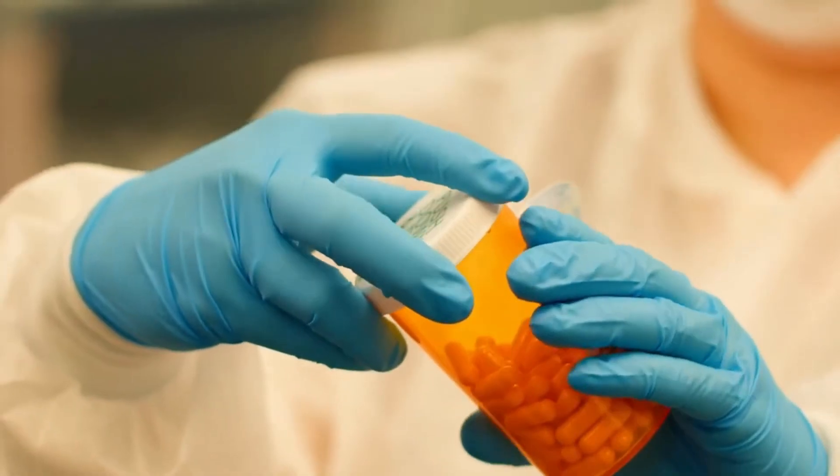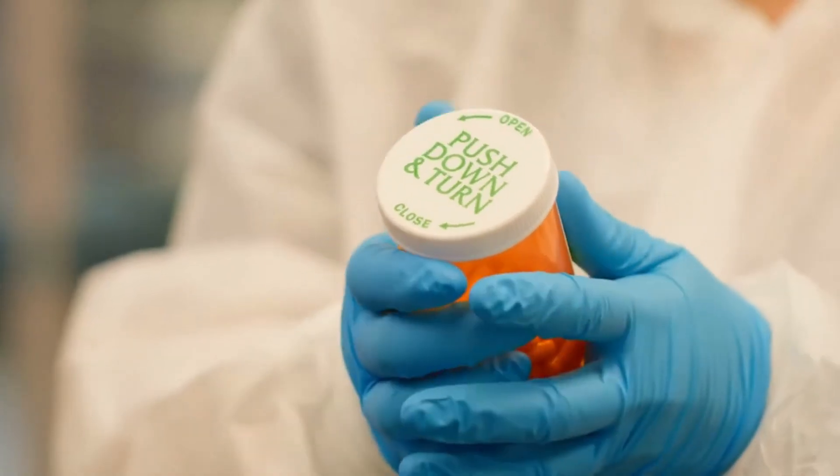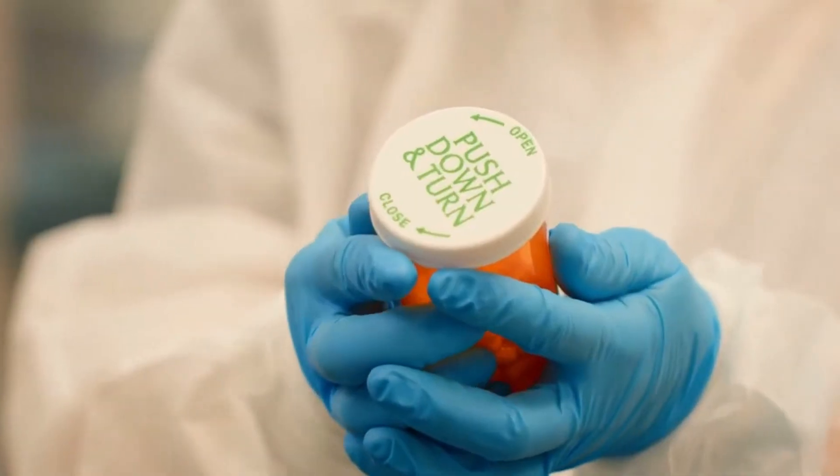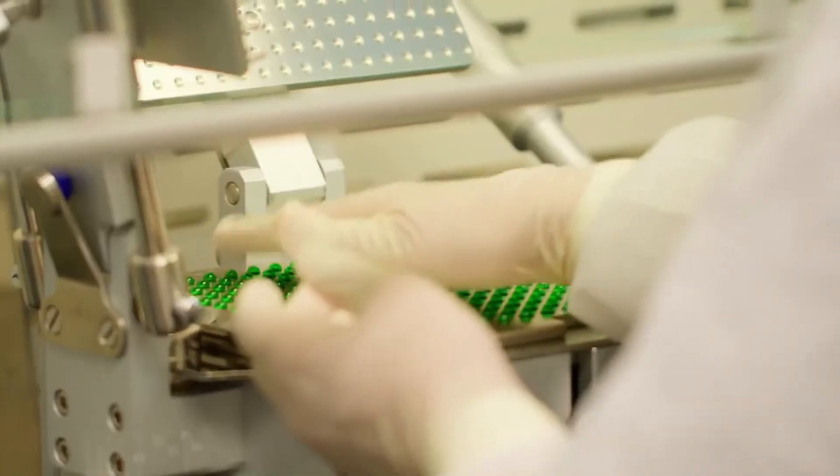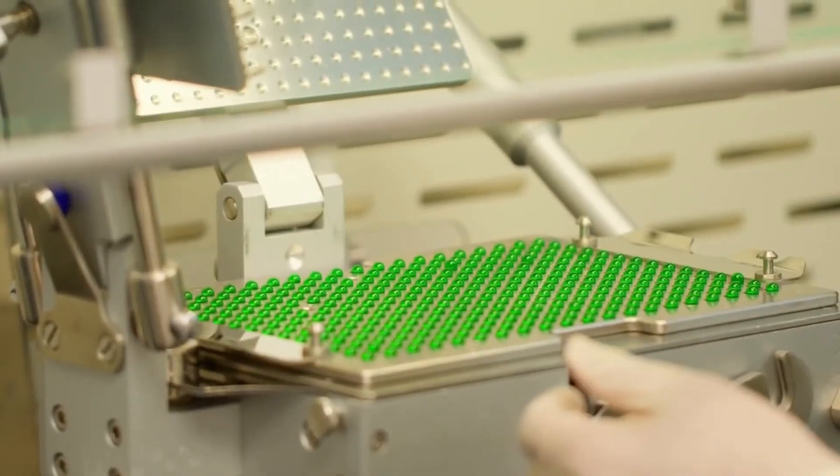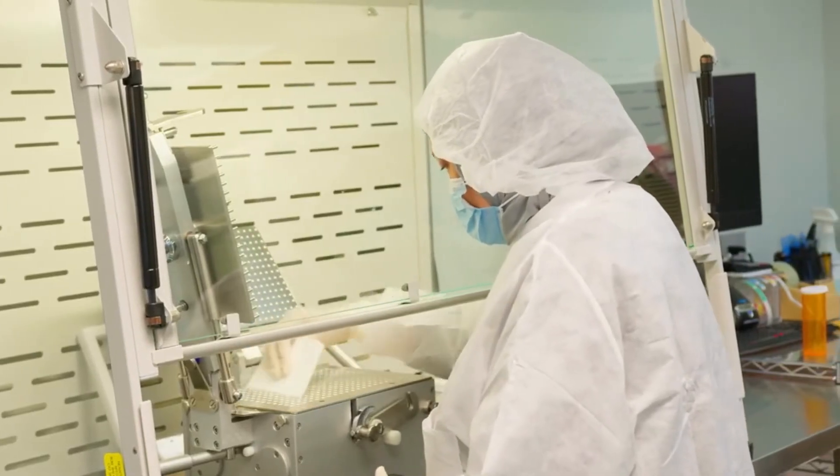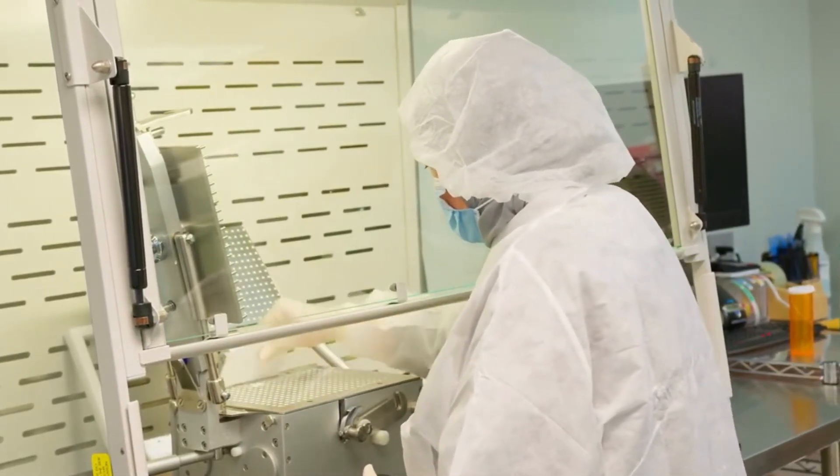In addition, at Town & Country Compounding, we have our own quality standards which go above and beyond what both New Jersey and USP require. Since people rarely have a chance to see our labs, I'll show you where we compound our medication.